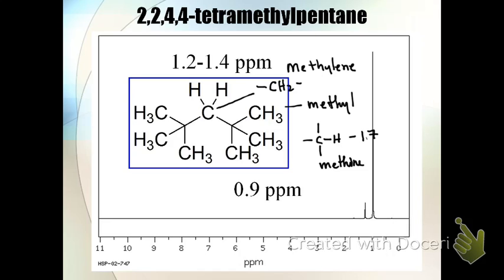And so you can look at the spectrum and see that it's relatively simple. That gives us actual information: there are no CH groups in this compound. Now, another thing to consider is the area under the peak. It doesn't show it here, but you can see that the area of the peak on the right is going to be a lot larger than the area of the peak on the left.